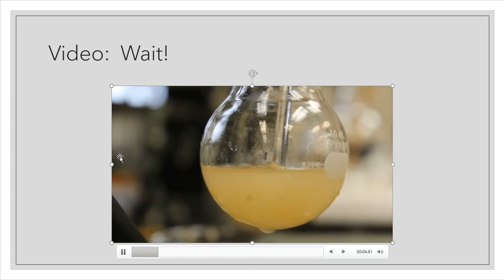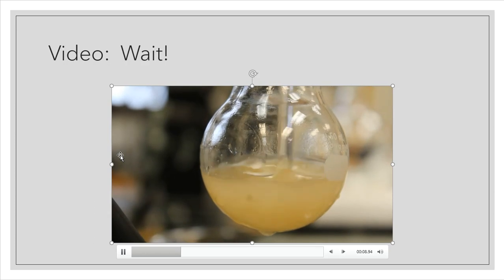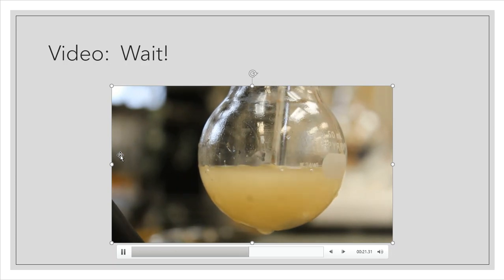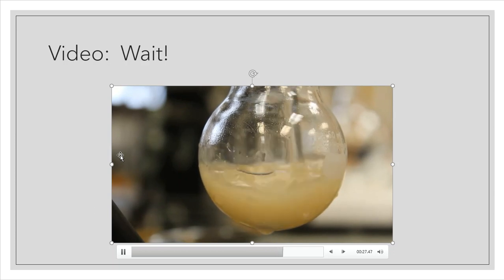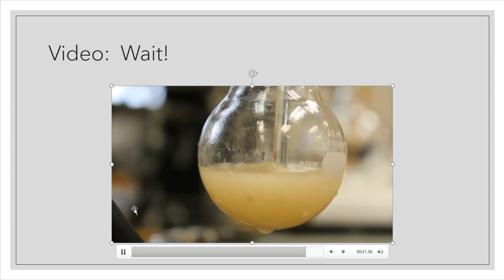Okay, so here's an update on the crystallization of that product after it gets out of the ice bath. As you can see, I am getting a very cloudy solution at this point, something that looks way different than what it was before, actually. And if you can't see that, just simply go back and look at the other video on how this started out. So I'm just going to continue to scratch. I'm just going to continue to stir, and this is going to help promote the crystallization and the precipitation of my product.